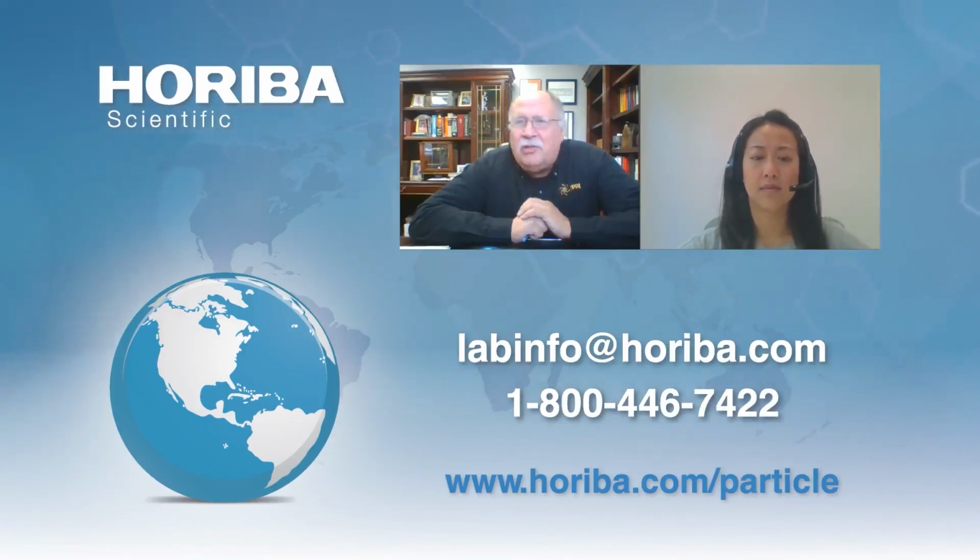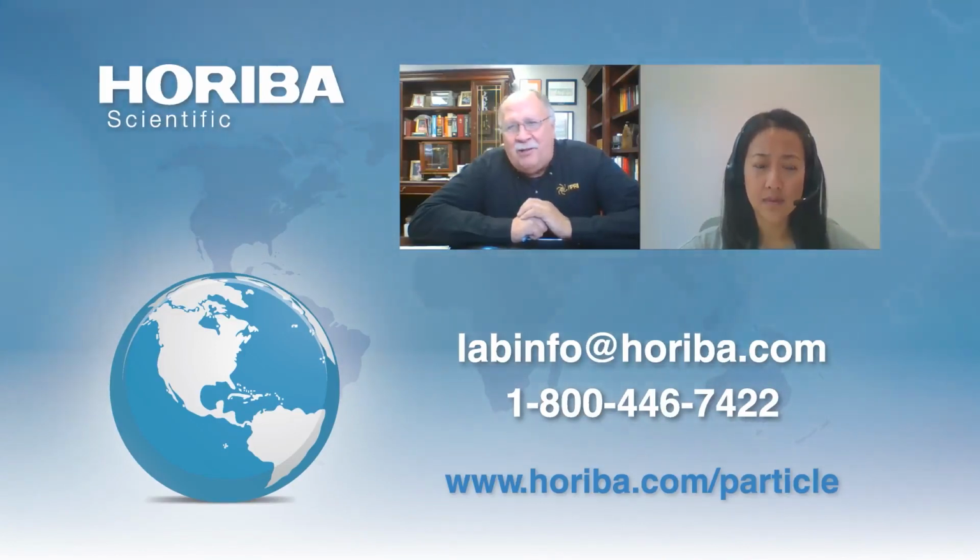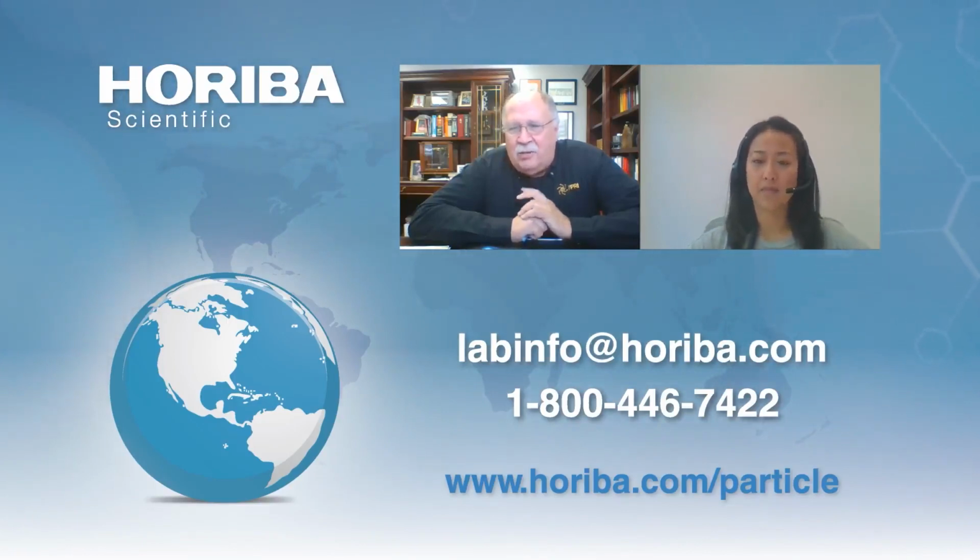I'm sure I'm missing some. I'm missing all my rheological equipment that we have. Zeta potential. You can't have enough analytical equipment. I can't impress that on anybody. I should be buying more every day.